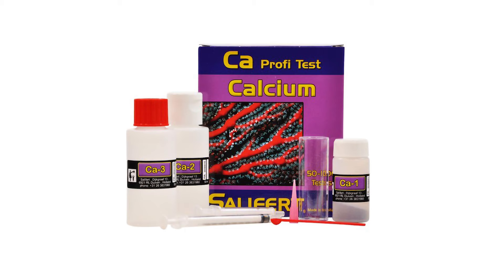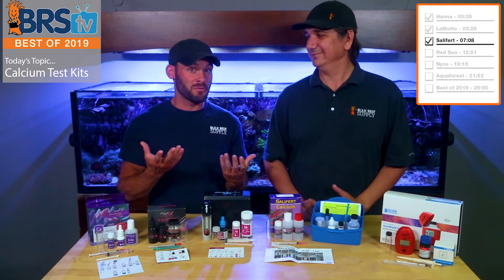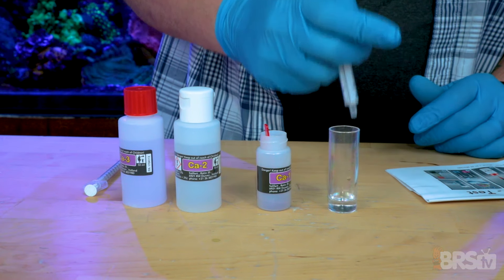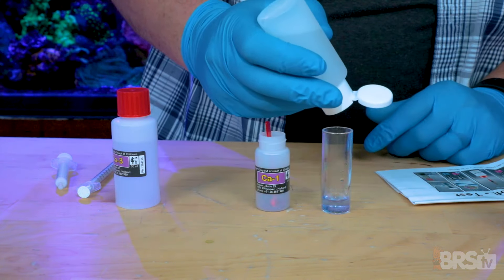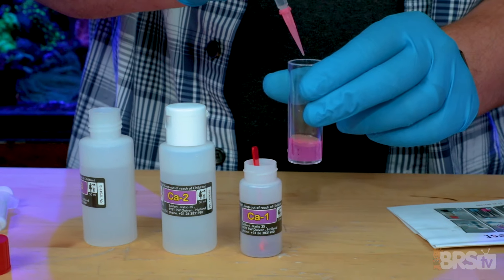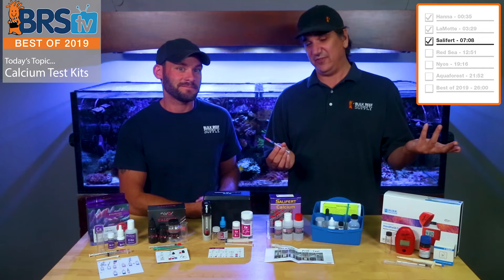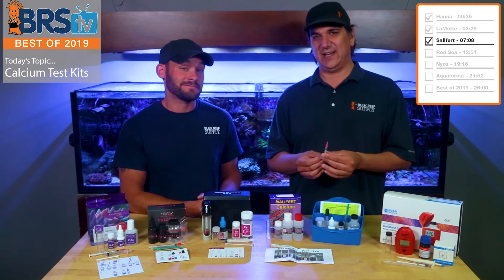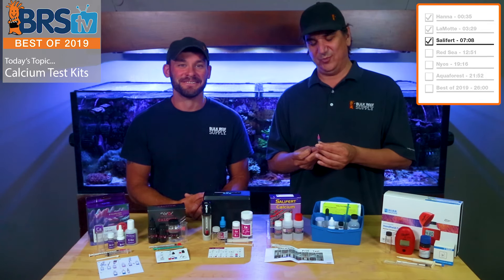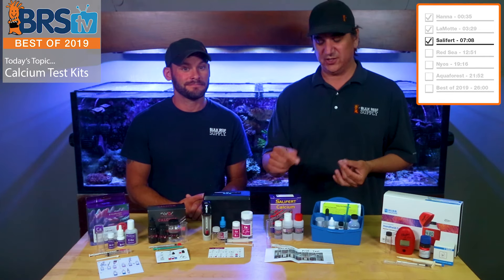Dollar-for-dollar, the next test kit definitely performed better. The first thing I like about the Salifert kit is the reading on the syringe. I find it really easy when the manufacturer makes the endpoint on the syringe easy to read — if it's between the 2 and 3 marks at the halfway point, that's 2.5. I go to my little chart, see what 2.5 is, and it gives me a reading. I don't have to do math. I just look at the syringe, look at the card, and I know my calcium. Some kits ask you to do the opposite — read how much you used and do the subtraction. Maybe you've had a couple of beers and you've got 1.8 and you gotta do the math — there's just no necessary reason for that.